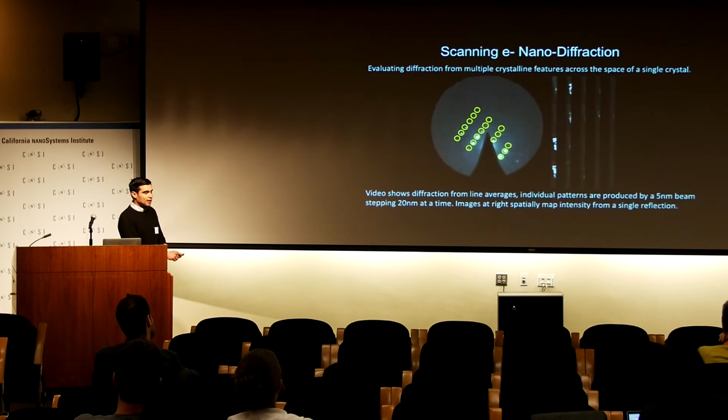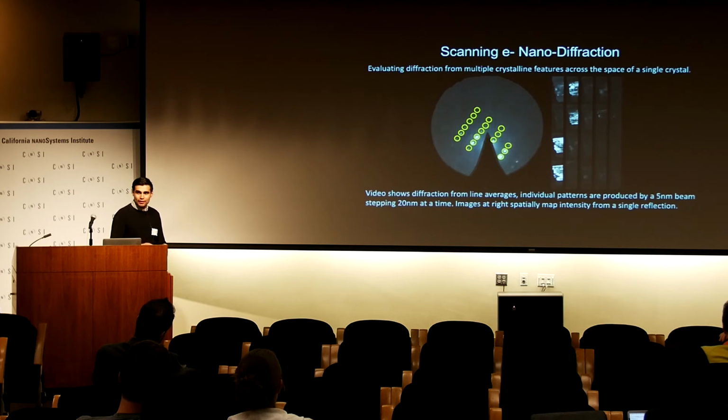So unlike a typical experiment that would sum all of this into a single diffraction pattern, now this is broken up into thousands of different patterns that give you nanometer scale orientation or information about the types of structures within your crystal.